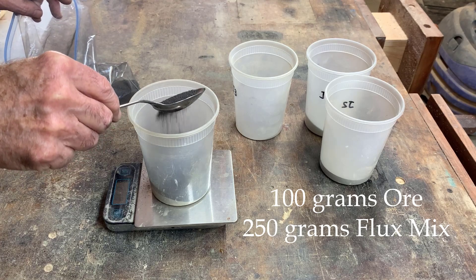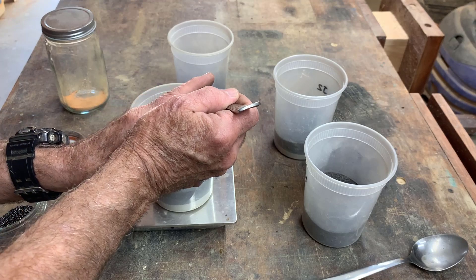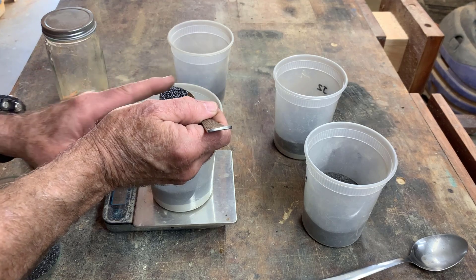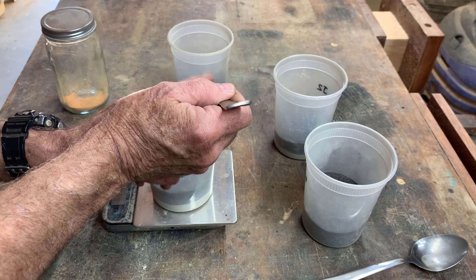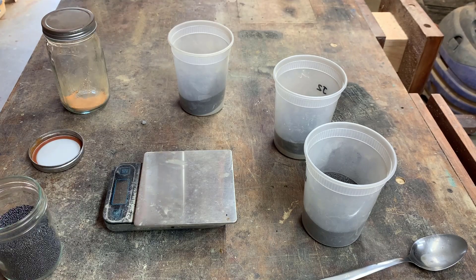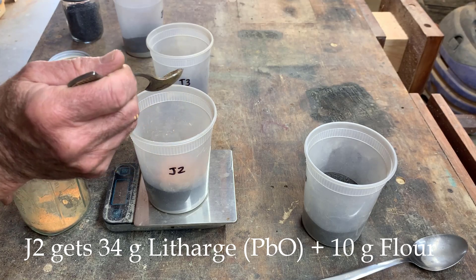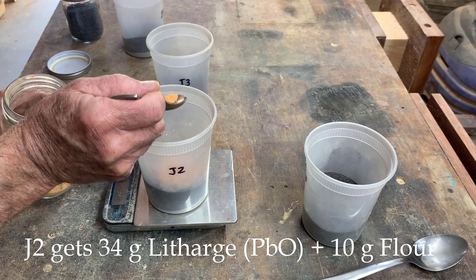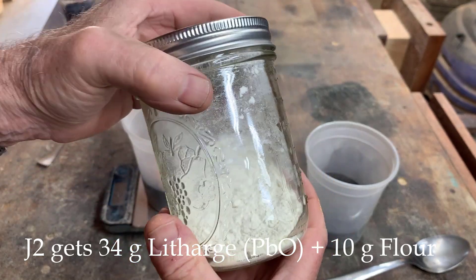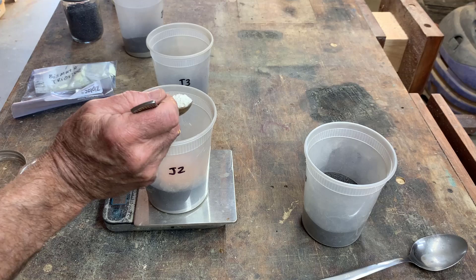In J1 I've got Assayer's Lead and I'm going to add 25 grams. To reduce the litharge in J2, I'm going to add 10 grams of flour. This reduces the litharge back to lead.